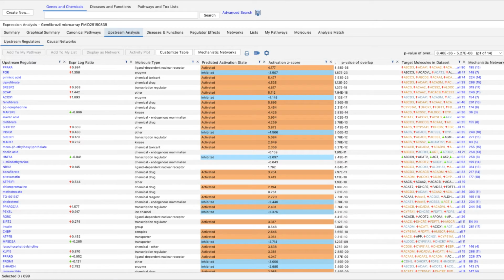The aim of upstream analysis is to identify which upstream regulators may be activated or inhibited to drive the differential expression or phosphorylation changes you see in your dataset. This can help you better understand how regulatory cascades control your experimental system. IPA users often use this section for identifying key regulators contributing to disease pathogenesis, drug targets and mechanism of action, as well as CRISPR and RNAi assay design.